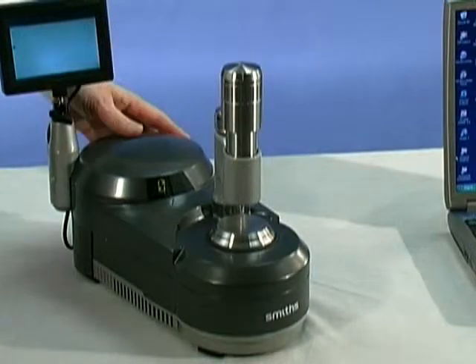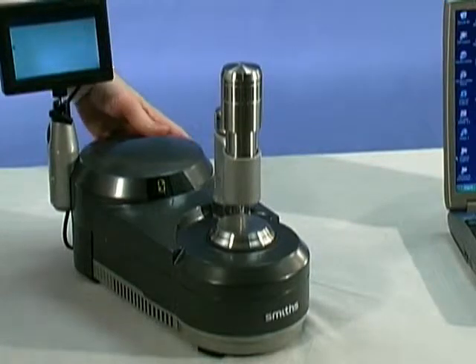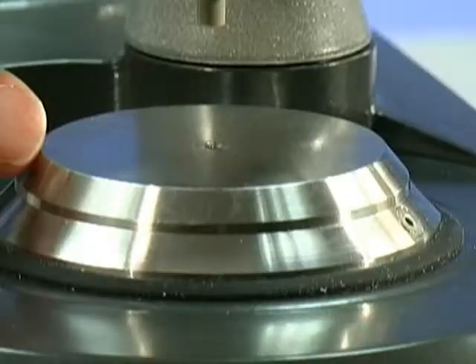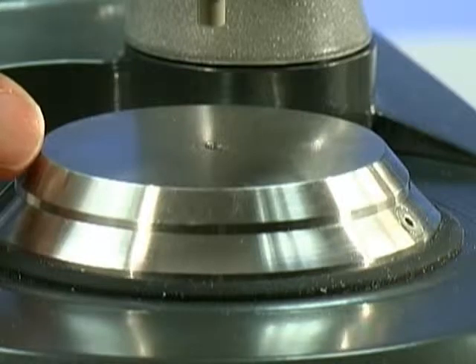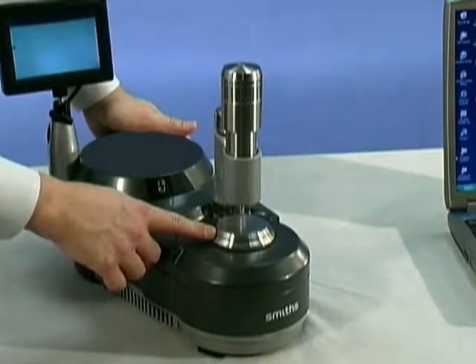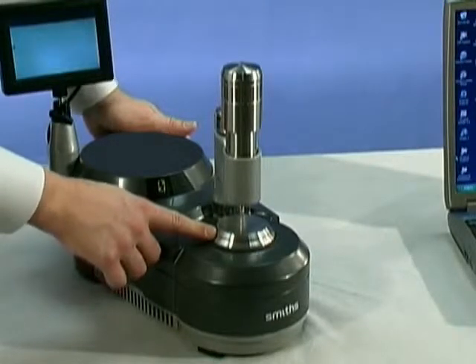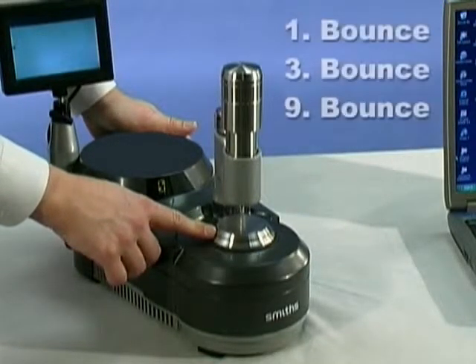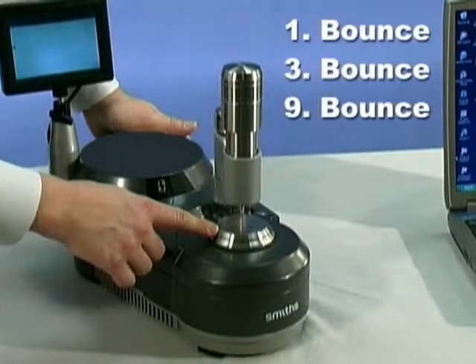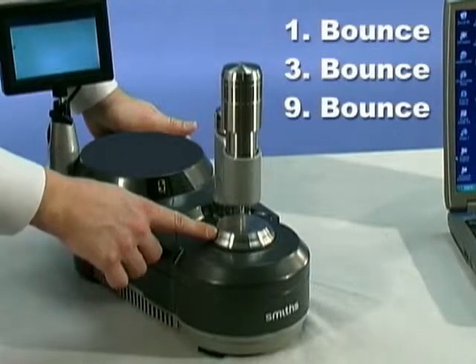In the front of the unit is the DuraDisc sample interface. This is a diamond ATR integrated into the system. The diamond ATR sampling interfaces come in three versions: a one bounce, three bounce, and nine bounce DuraDisc available for the system.